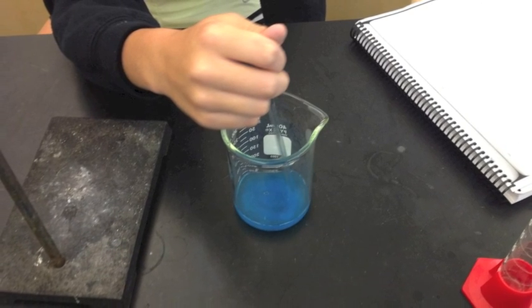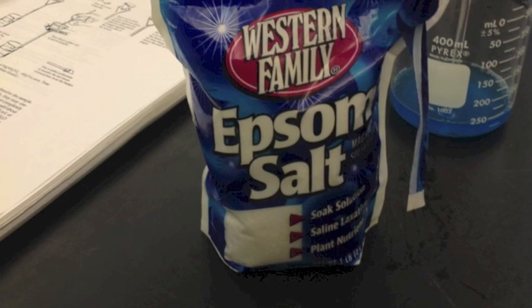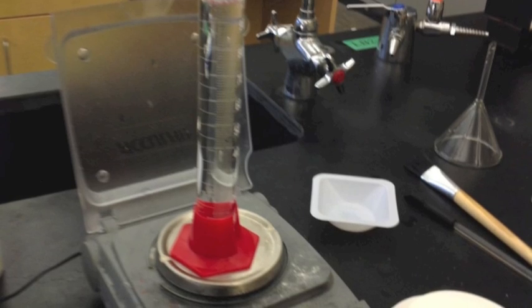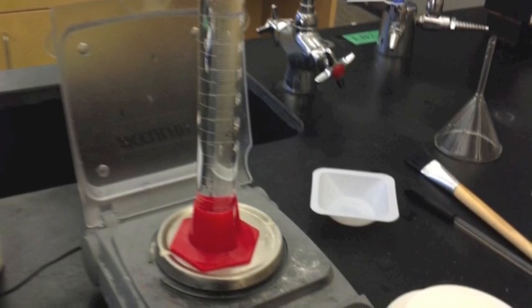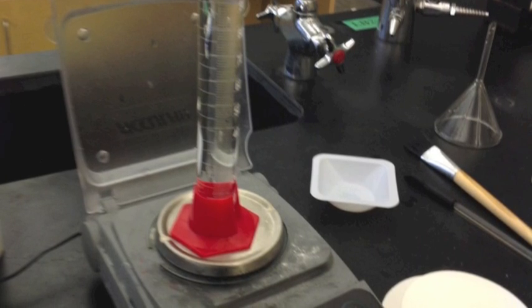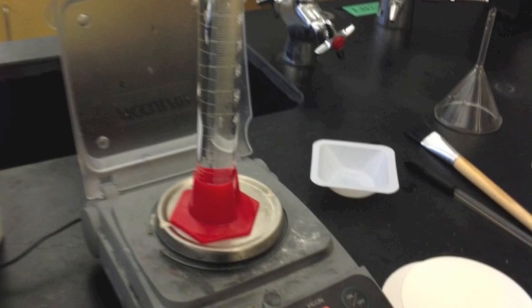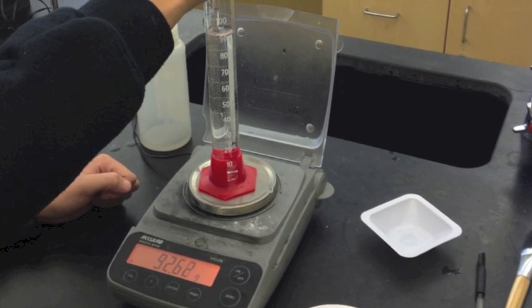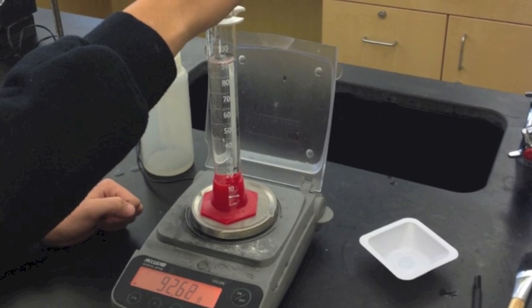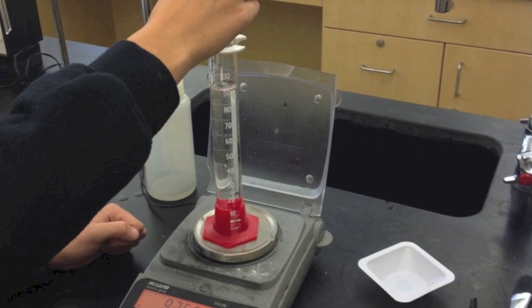Mix it together using a stir rod. The Epsom salts — actually the magnesium sulfate — are what we'll be using, and you need to make a 10% solution of that. Since you have to measure out the mass of the MgSO4, you also have to get the mass of the water. Put the graduated cylinder filled with water on the scale to get its mass, then use a pipette to adjust the volume so you can get it to the proper mass — 90% water and 10% magnesium sulfate.